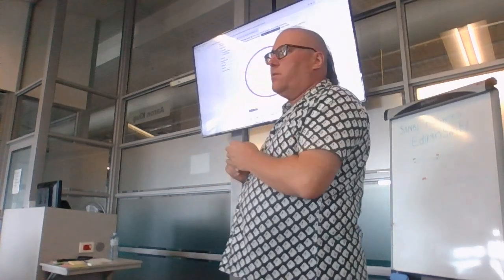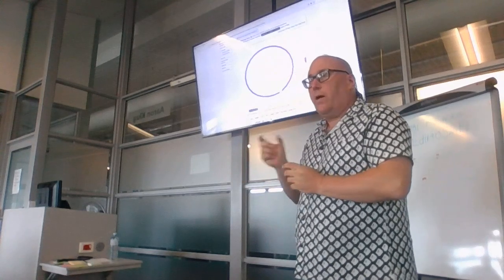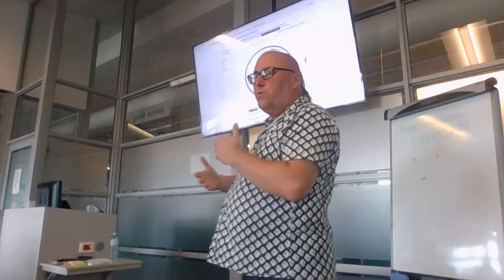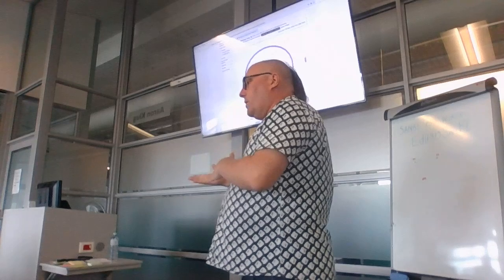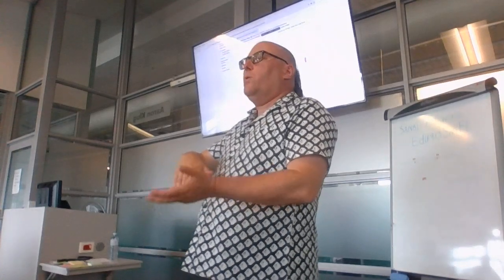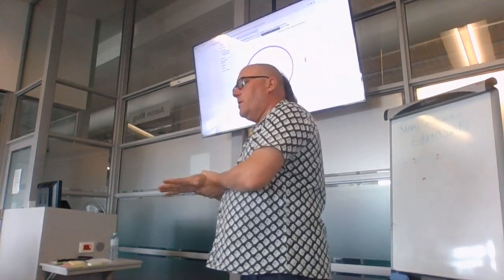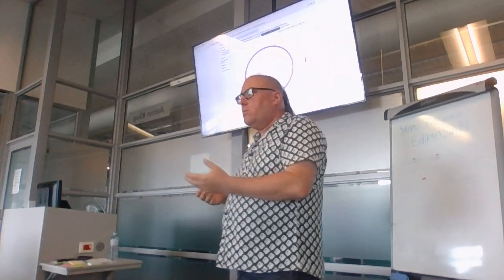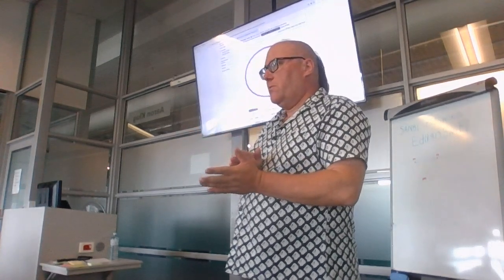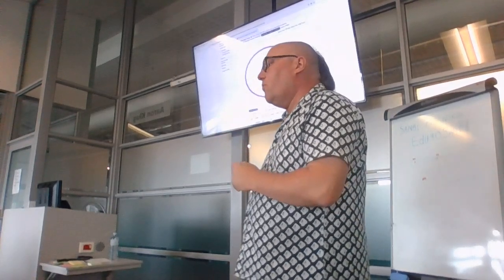And then the final thing about nanopore accuracy that's showing up in the results is that what's probably throwing off that last bit of accuracy that we want is methylation of the genome. Because remember, Illumina is working with a copy of your DNA, okay? So when you're making an Illumina library, it's not the original DNA that you extracted. But when you're working with nanopore, you are working with the actual original extracted DNA, and the DNA has the methylation of the original DNA, and that methylation can throw the base caller off, okay? So some of the areas where it's difficult to get accurate results seem to be related to methylation patterns.